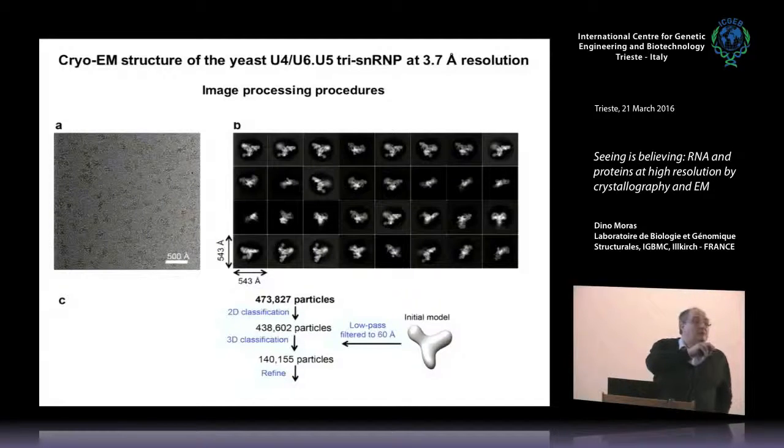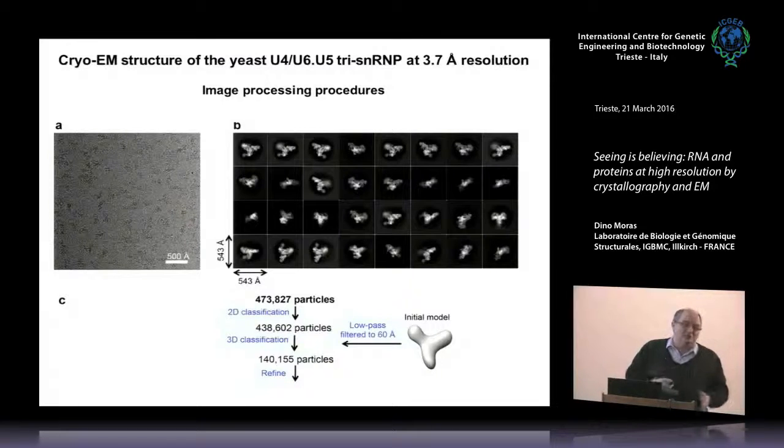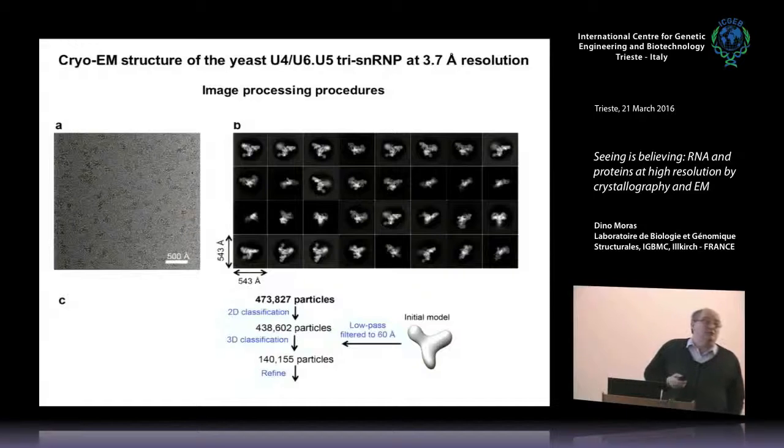Well, after the joke. Isn't resolution defined by the resolution of these crystallographic structures? No. It's a better resolution with EM data. I haven't checked. I think it's still the same detector. They were collecting data, and they were on their way to go, actually. They had no way of going even beyond that. But since the competition was publishing, they had to close. So based on EM data, one can reach such a resolution? Sorry? Oh, you start as soon as you can. There is no answer. You just keep improving, depending on the data you have, the quality of the data. It's a progressive thing.